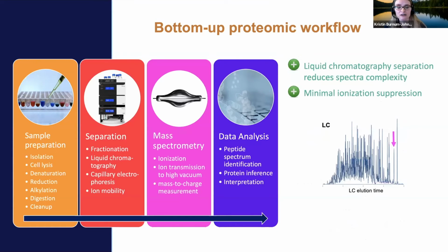Now let's discuss our separation steps. We're currently using liquid chromatography separations to reduce spectral complexity. As you see in the chromatogram there on the right, these peptide peaks elute over time. Therefore, liquid chromatography separations reduce spectral complexity and minimize ionization suppression.